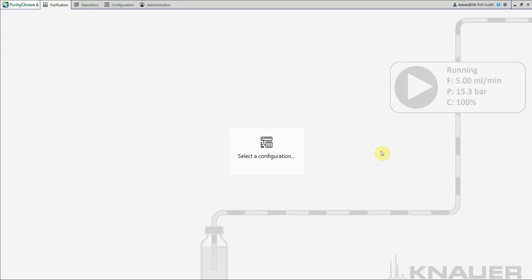Welcome to the PurityChrom 6 tutorial, how to set up a configuration. In this video I will show you how to add a new configuration to your software. First, inside our software we choose the Configuration tab.